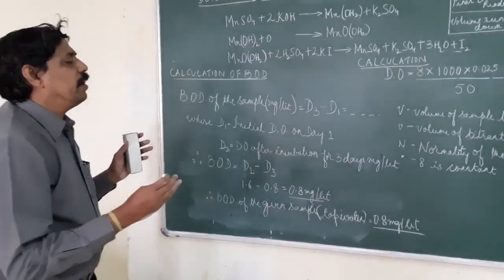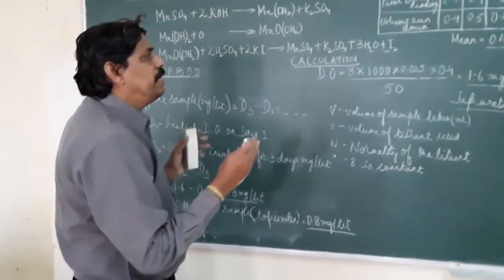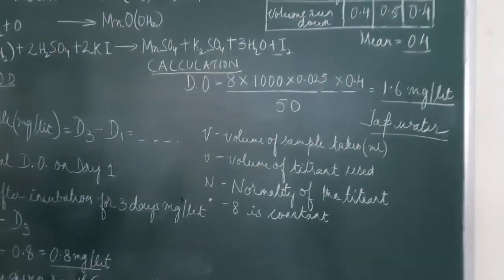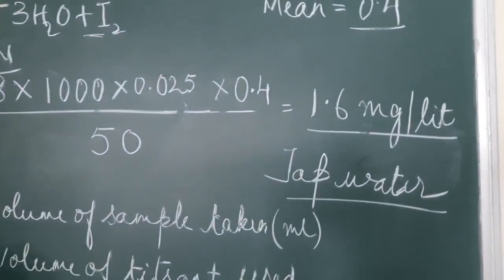So the dissolved oxygen for the first sample is determined, and you get to know the dissolved oxygen levels on day 1.